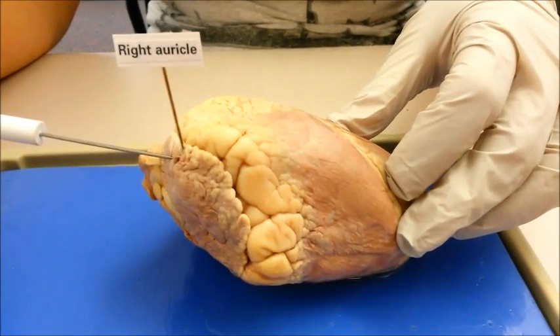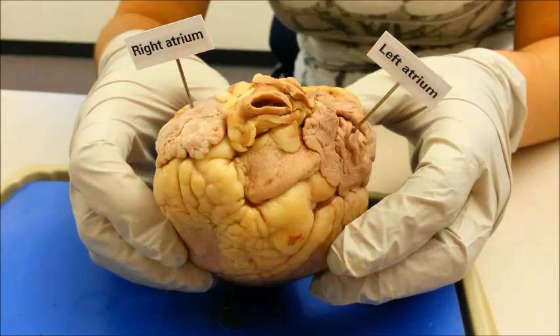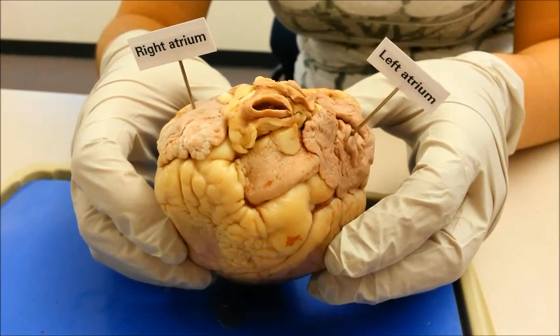The auricles are ear-like flaps that are made up of muscles from the atria. The atria are made up of two upper heart chambers. These two chambers have thin walls and receive the blood returning from the body.